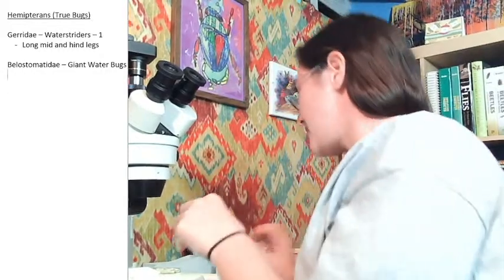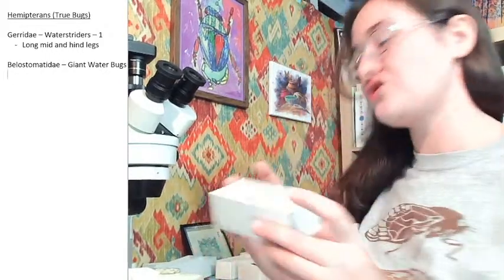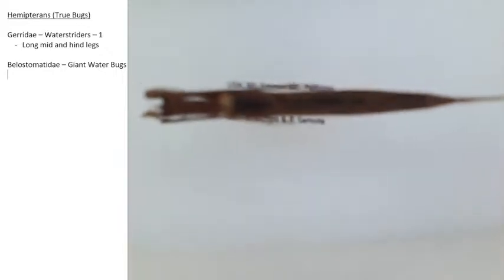The next guy, I just want to show you him real quick. He's pretty awesome. I actually took some pictures and used him as a Guess That Bug on my Facebook page. Let me see if he'll focus.